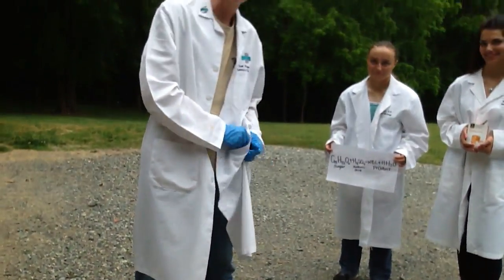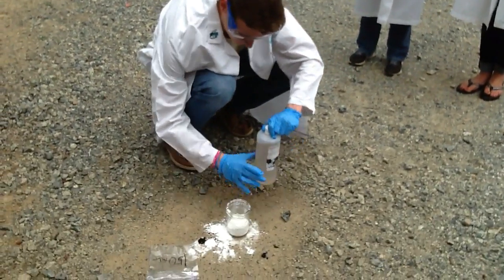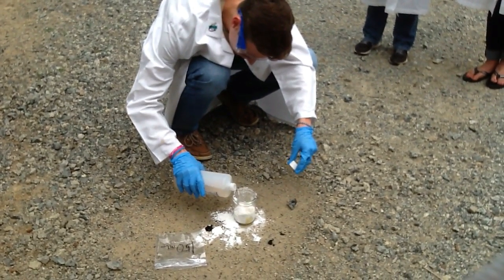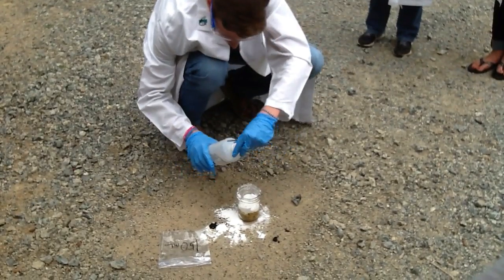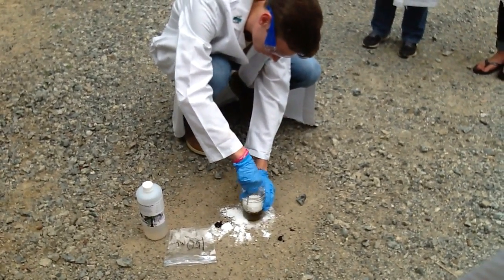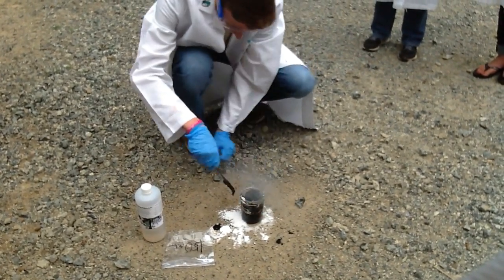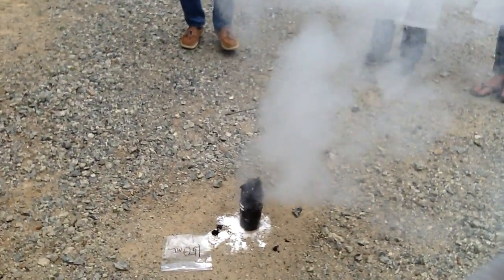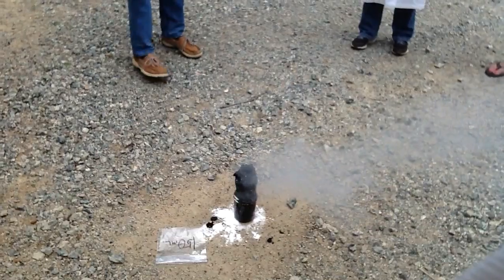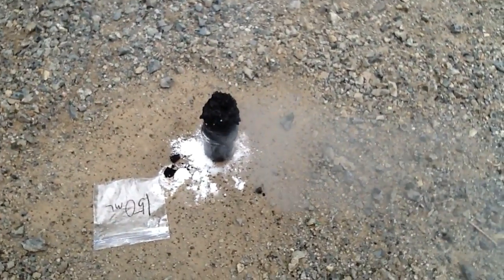And I have a stir to stir it all up. Oh, Lord. As you can see, the chemical reaction has occurred. The 150 milliliters, that's awesome.